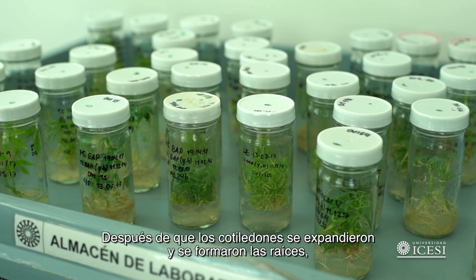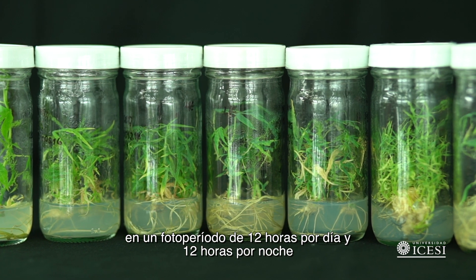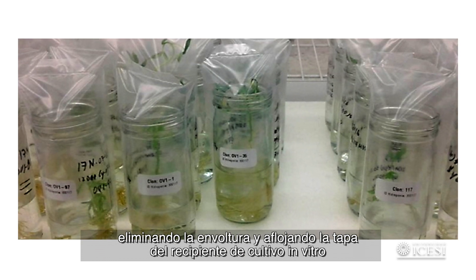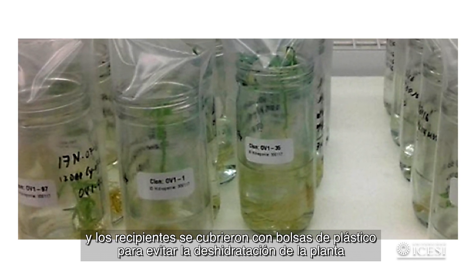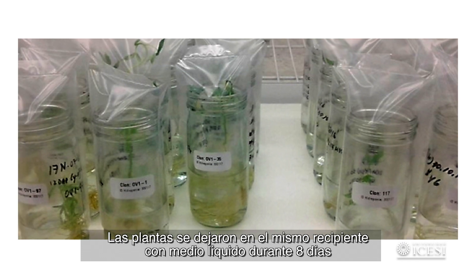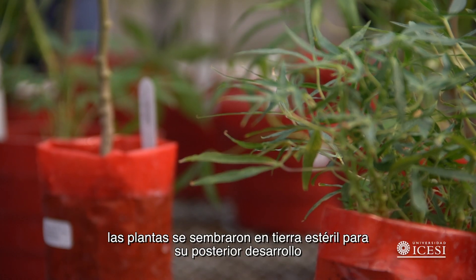After cotyledons expanded and roots were formed, plantlets were transferred to medium for plant elongation and complete development, incubated at 28 degrees Celsius in a 12-hour light and 12-hour dark photoperiod. Fully developed in vitro plants were acclimatized inside the culture room chamber for two weeks by eliminating the food wrap closure and loosening the jar cap. Solid medium was replaced by liquid medium and the jar covered with plastic bags to avoid plant dehydration. Plants were removed from the vessel, roots washed with running water, then transferred in the same vessel with liquid medium for eight days, before being moved to trays for hydroponic culture. After profuse root development, plants were transferred to sterile soil.